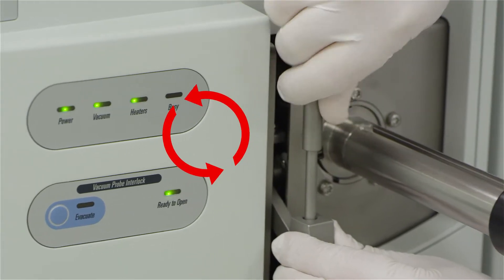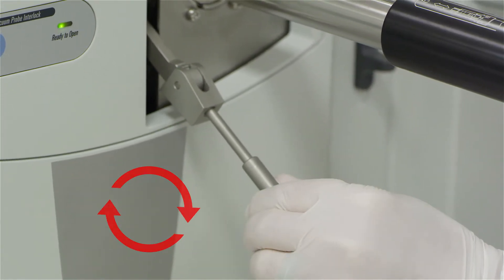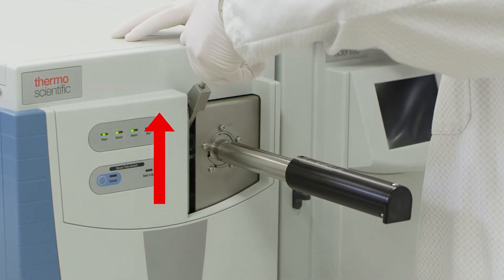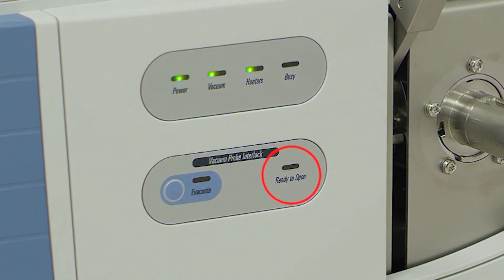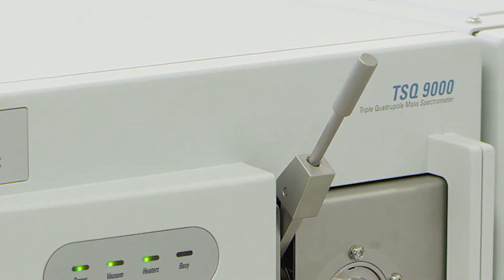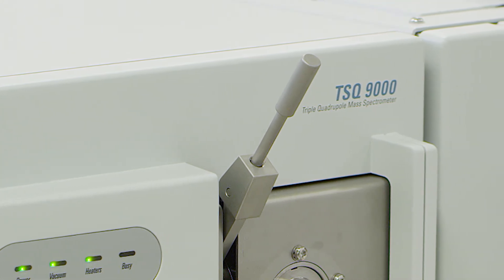First, to change the lever positions, unscrew the arm and move down, then retighten. The lever is now able to be lifted upwards, freeing the path for the source installation tool. When you lift the lever you will notice the green light for ready to open is no longer on. This lever must remain completely up while you are inserting the tool; otherwise obstructing the path of the source installation tool may damage the interlock mechanism.